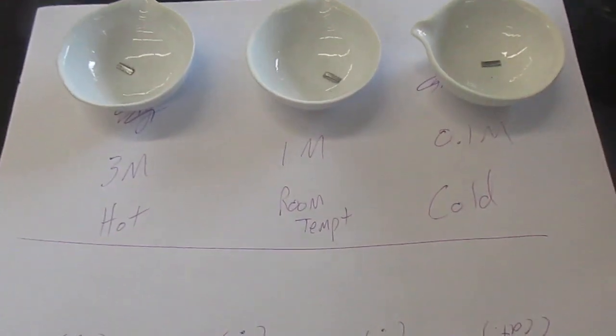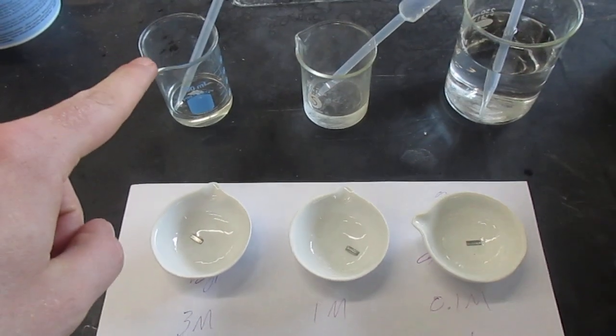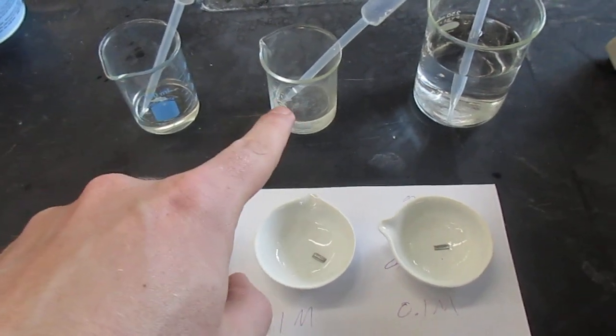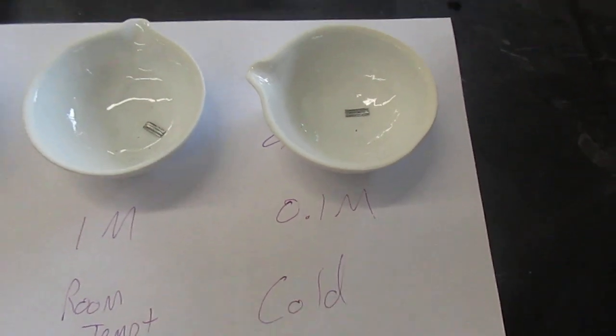Next, we're going to look at concentration. So here, this one is going to have 3 molar hydrochloric acid, which is three times as strong as the 1 molar which we used in the last one, and we have a 0.1 molar.